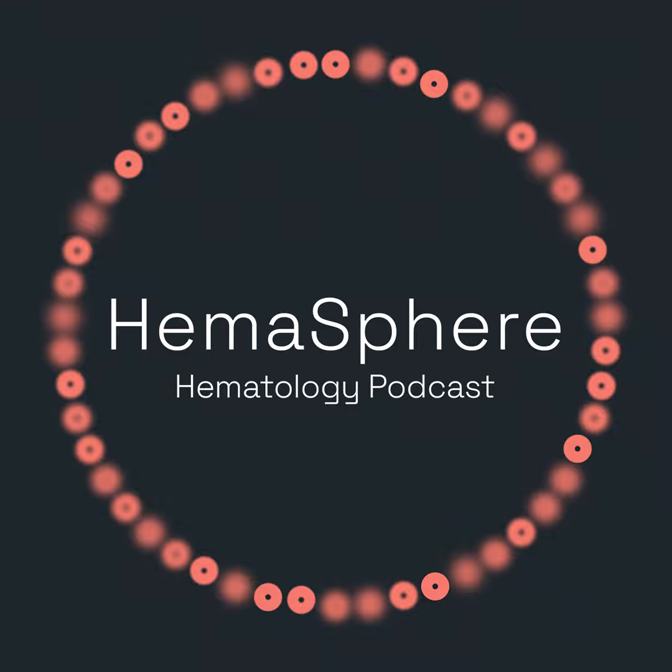So it can take up half an hour to an hour or more for a single analysis. And even then, it's often checked by a team of experts to form a consensus on what the leukemic cells actually are. And also, by nature, I think because it's done by hand, it adds a subjective element into the analysis that you don't want to have, of course, in your clinical settings.